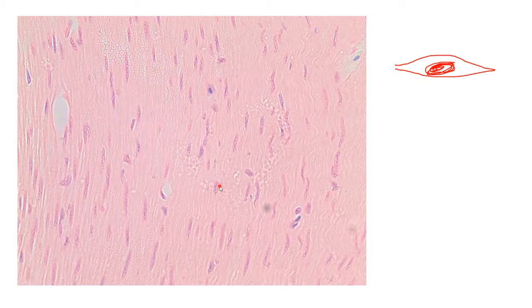Your guided lesson tells you that you need to make sure that you compare smooth muscle tissue to dense, regular connective tissue. When you compare the two, one of the best tip-offs, the biggest things to look for, is these nuclei.